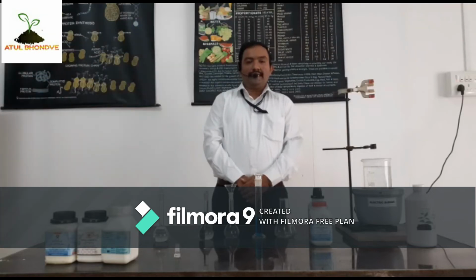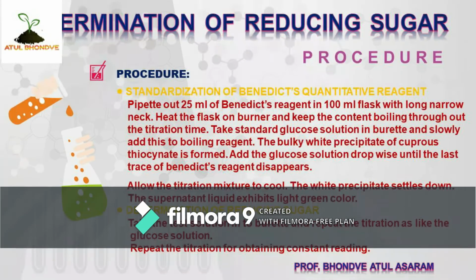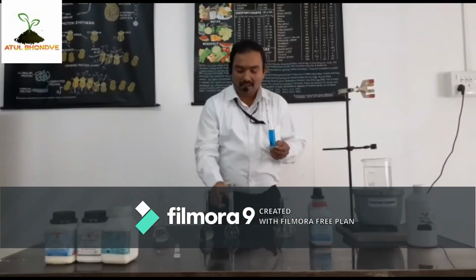The actual practical. First step is standardization of Benedict's reagent. In the standardization of Benedict's reagent, pipette out 25 ml of Benedict's reagent into a narrow neck flask. We already measured 25 ml of Benedict's reagent in the measuring cylinder, and now we will transfer it into the volumetric flask.